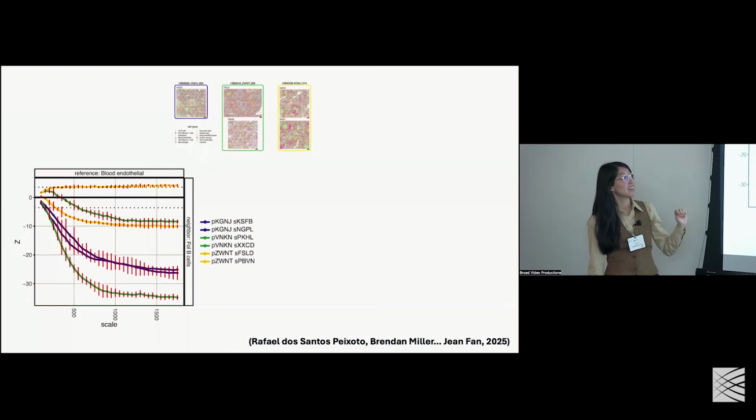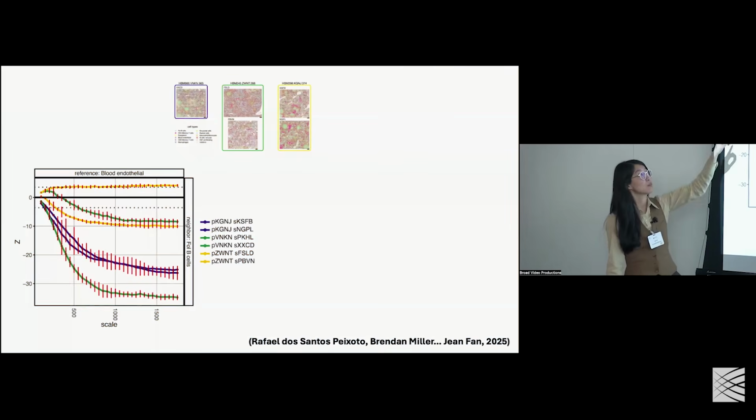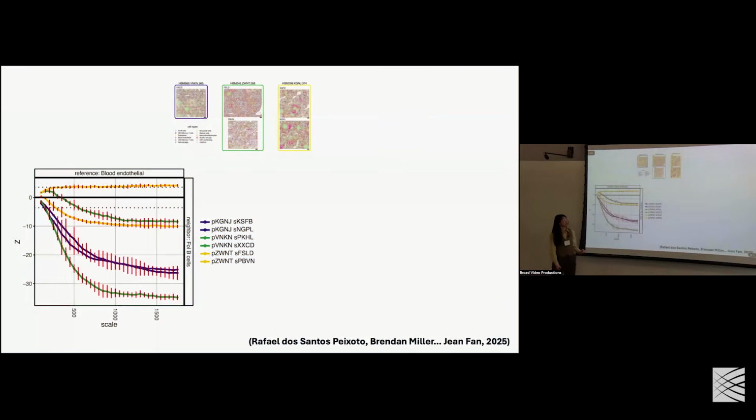And in this case, just cherry picking some examples where this is a particular pairwise cell type relationship that's very different across every tissue section, even within the context of the same patient, which speaks to different sectioning, let's say just tissue sampling variation. So this is blood endothelial cells with respect to follicle B cells. So you might imagine the vasculature is quite different depending on the section that you take.